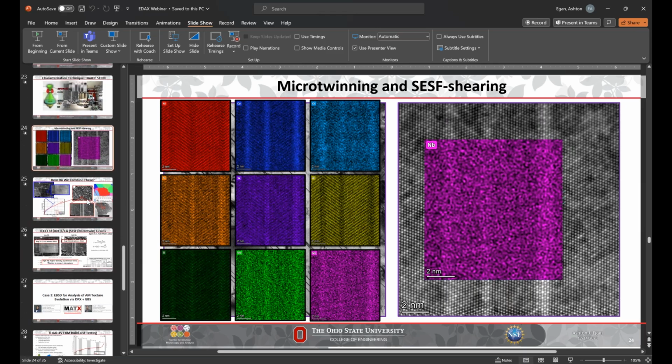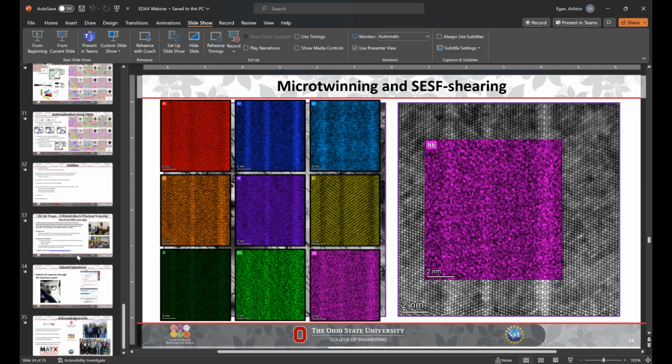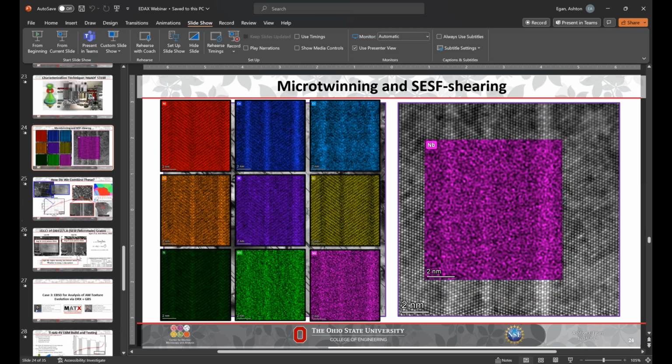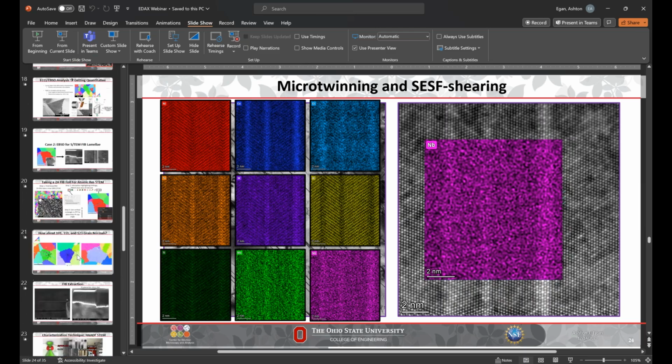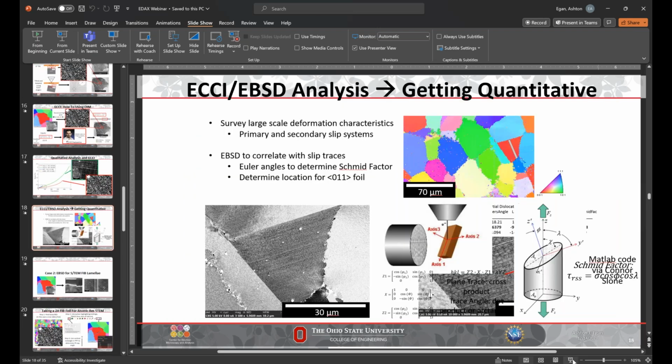But in reference to the angle, I'm assuming you're talking about the convergence angle of the beam, which is honestly unknown.